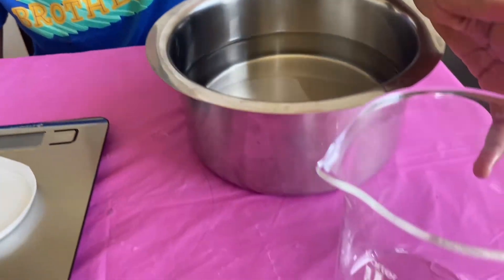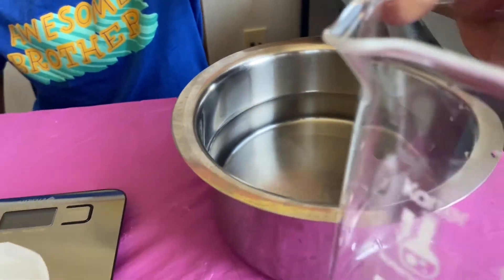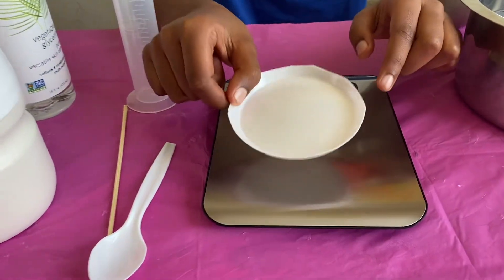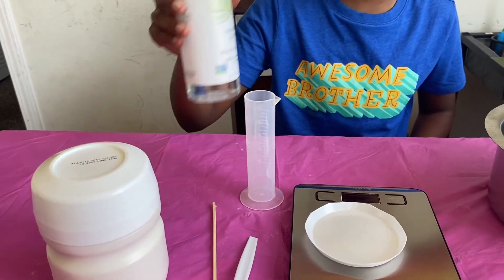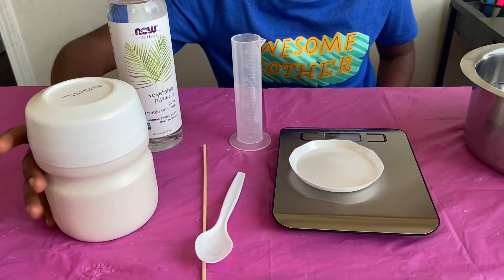Today we're going to make disposable plastic bags. You will need a beaker, 1000 milliliters of water measured with this beaker, a scale, weightless paper, a cylinder tube, and gelatin.